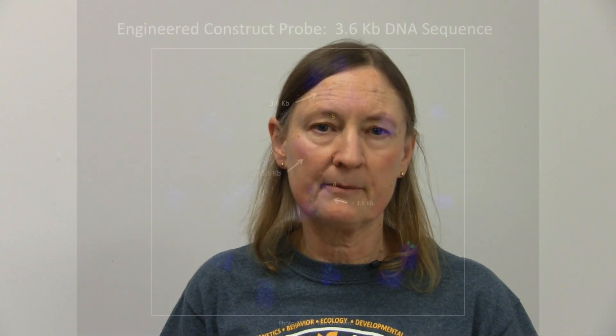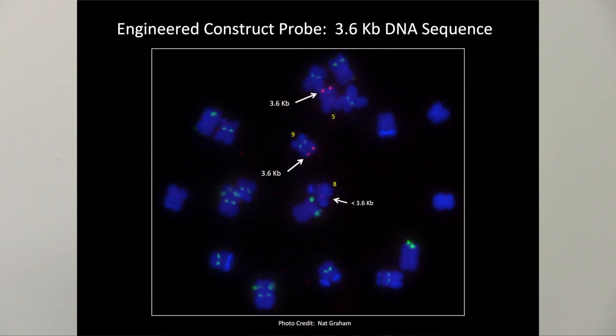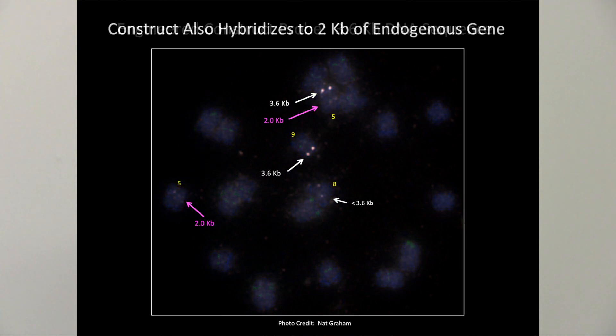As previously mentioned, FISH can also be used to identify the location of transgene insertions. This image shows 3.6 kB insertions on chromosomes 5 and 9, and a smaller insertion on chromosome 8. Less obvious on this DAPI stained image is hybridization to a 2 kB region of the transgene probe to its endogenous gene, UB1, on both homologues of chromosome 5. The hybridization signal produced by the shorter sequence is considerably weaker relative to the background noise.